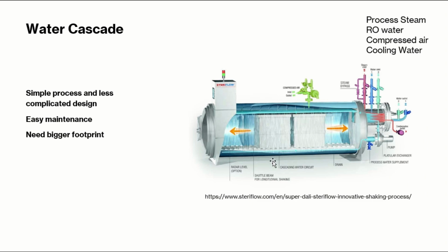As I mentioned in my earlier slide, the footprint could be really important for this kind of machine if you want to sterilize, because as the water comes from top to bottom, the delta distribution of temperature gets high from top to bottom, because the hot water touches the top surface and cools down as it reaches the lower shelves.